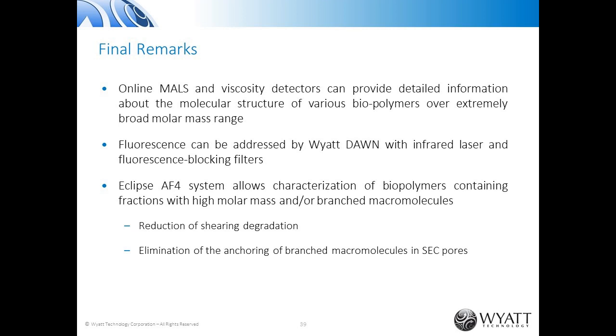Then derivatization helps a lot, and especially if we make cellulose tricarbanilate, then it is well soluble in THF, and then it can be nicely measured. So I don't have a 100% recommendation. If you find a way to dissolve it, then I would try to avoid derivatization. But many times it is impossible, and then derivatization helps.